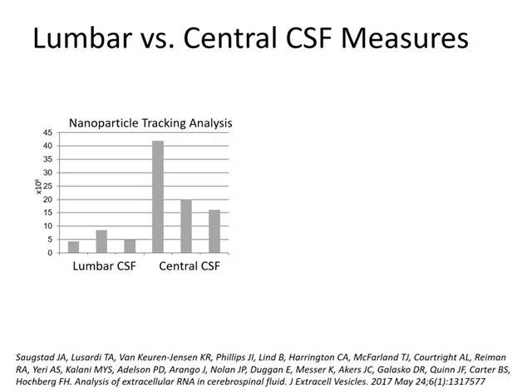Earlier, I mentioned studies that we've done to examine the difference between lumbar and central CSF measures. This was a collaborative study that we did a few years ago, and the image here shows that by nanoparticle tracking analysis, there are far more nanoparticles detected by NTA in central CSF than in lumbar CSF.